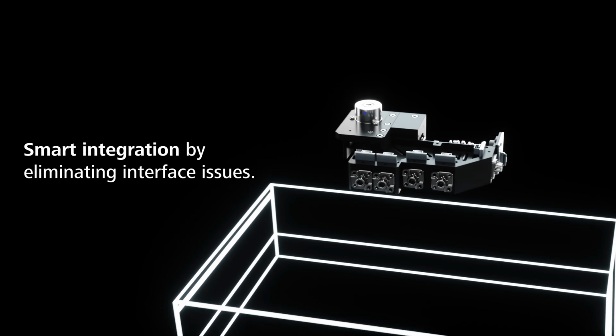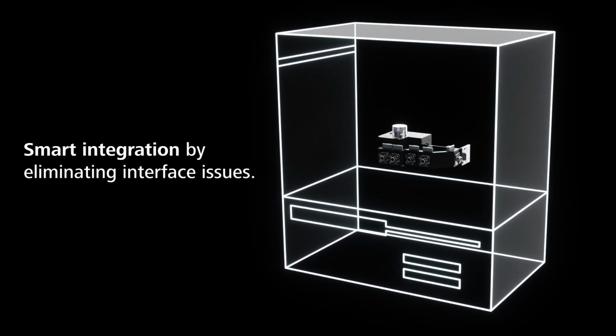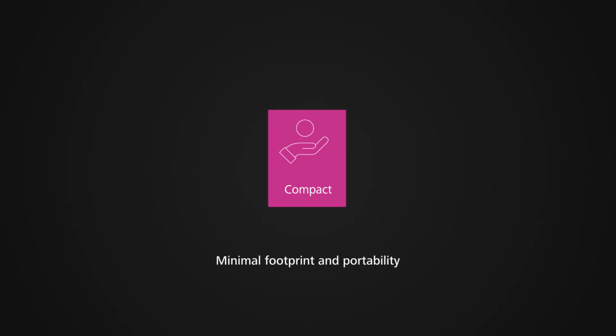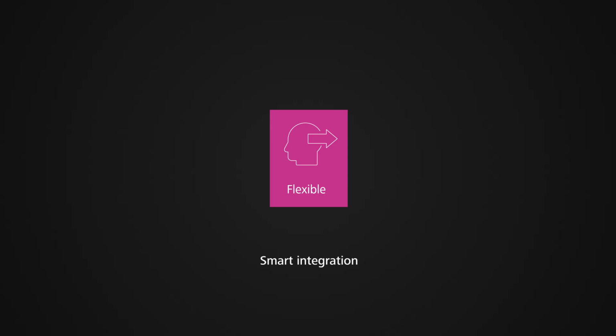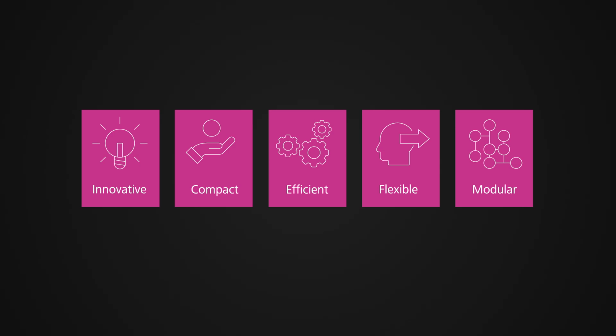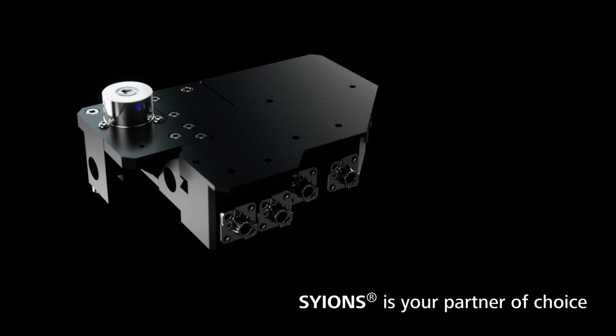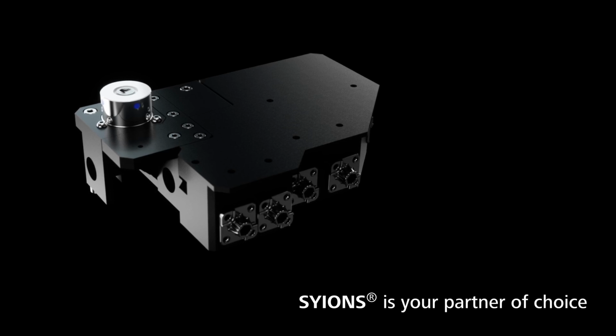JENOPTIK SYIONS allows smart integration by eliminating interface issues. There are many compelling reasons to develop your next life science application with SYIONS. SYIONS is your partner of choice for rapidly constructed, miniaturized optical engines that will fit into any instrument.